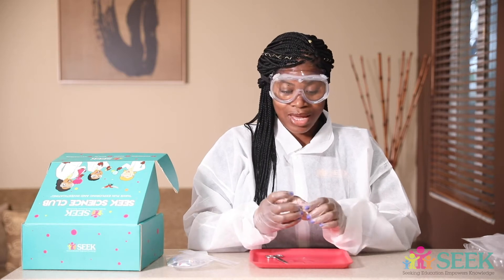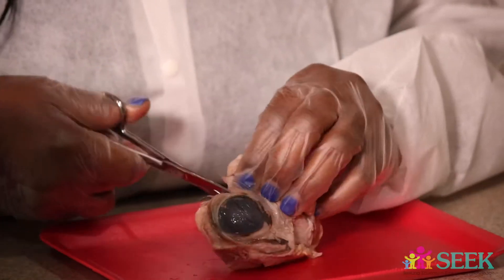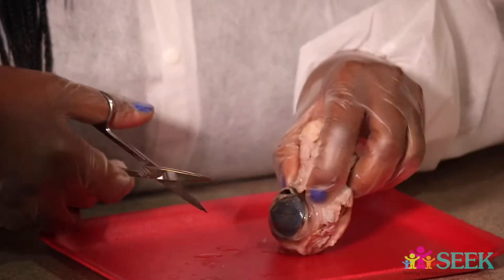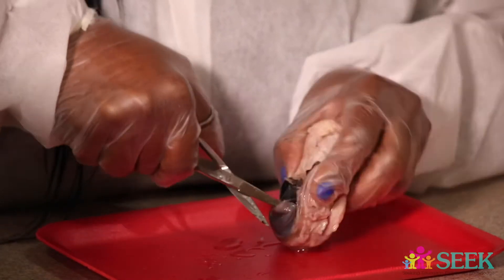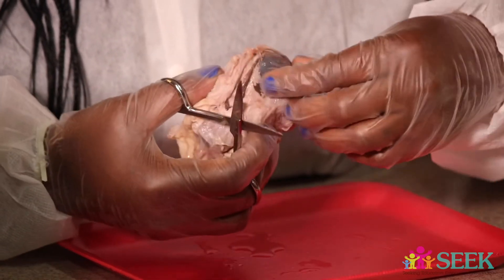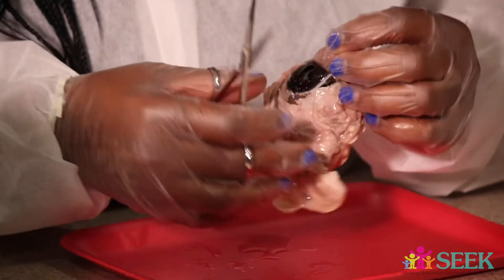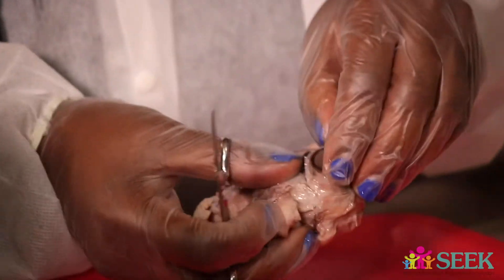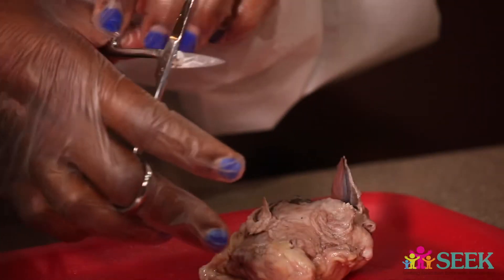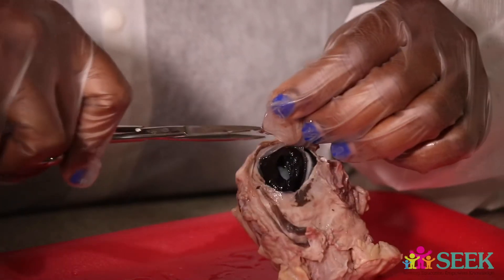Let's go ahead and see if we can cut this open and find some juicy stuff inside the eyeball. You see, this is the clear part that protects the actual lens here — we all have that over our eyes. Isn't this awesome to learn about the structure with hands-on materials? You don't have to wait if you're not in school, because sometimes with dissections it doesn't happen until middle school or high school, but you can do it much earlier to see if you have a love for it.